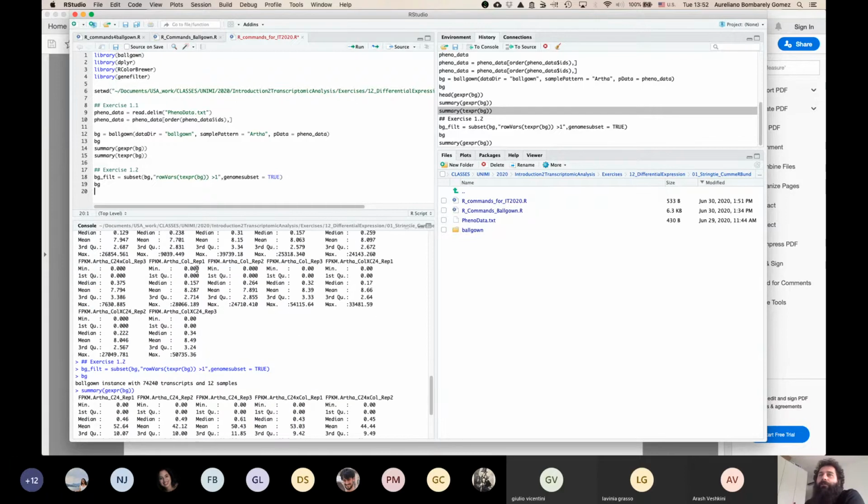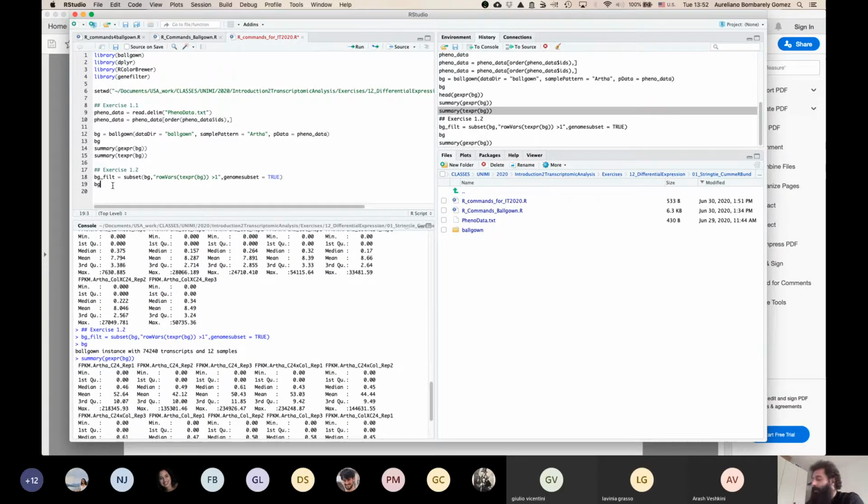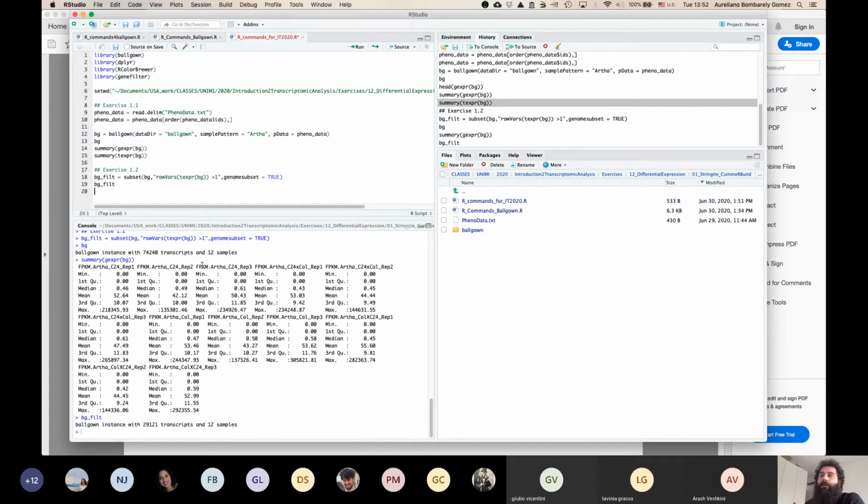Apologies. I was saying, oh, this is strange. You're right. Okay, so you see that we reduced the number of transcripts.